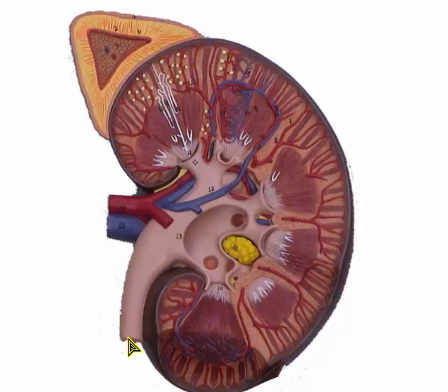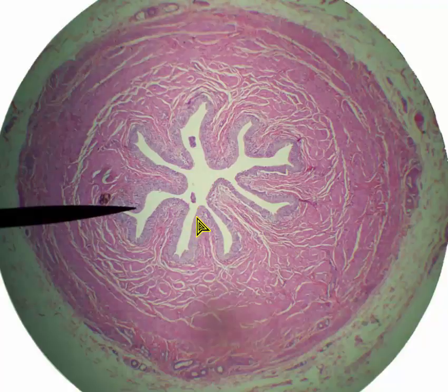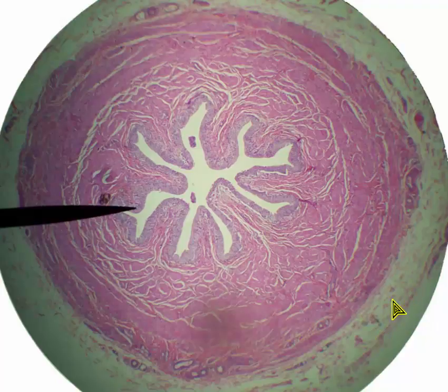What we're looking at next is the ureter, the tube coming from the kidney that carries the urine to the bladder. This is a cross section of a ureter at 40 times magnification. You should know the layers of the ureter. The innermost layer is called the mucosal layer or the mucosa. Just underneath the mucosa is the submucosa. Out here we have muscularis wrapping all the way around. Outside of the muscularis, at least in most of the run of the ureter, we have adventitia, which is connective tissue — a combination of adipose tissue and areolar tissue.